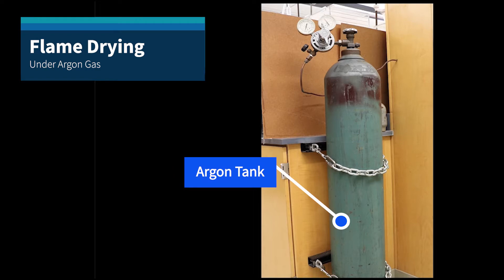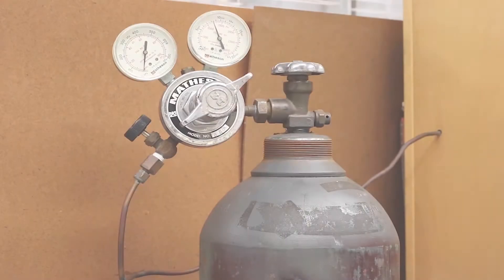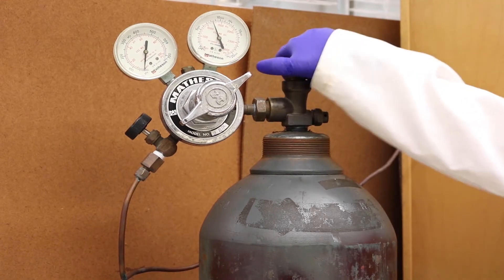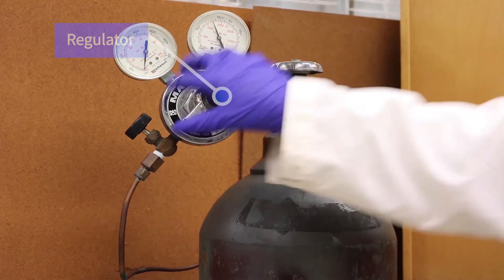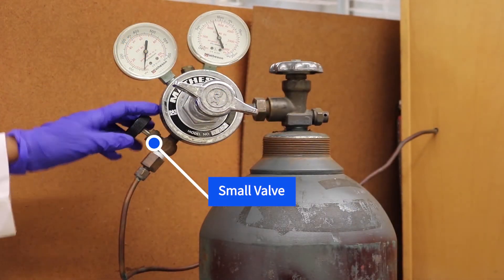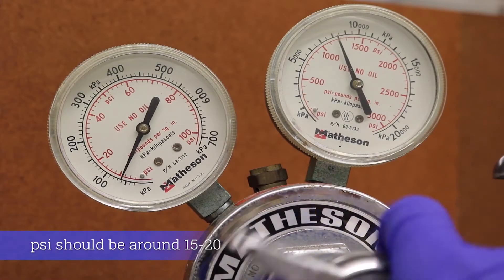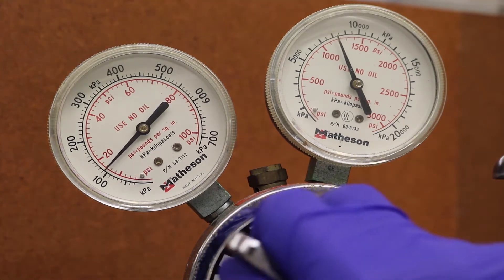Make sure the tank is secure with a chain around it at all times to ensure that the tank does not fall over or get damaged. First, turn the parts of the argon tank counterclockwise in the following order: the main valve which opens the tank, the regulator which adjusts the pressure of the argon gas, and the small valve which is connected to the manifold. Make sure the argon pressure gauge is between 15 to 20 psi by adjusting the regulator.